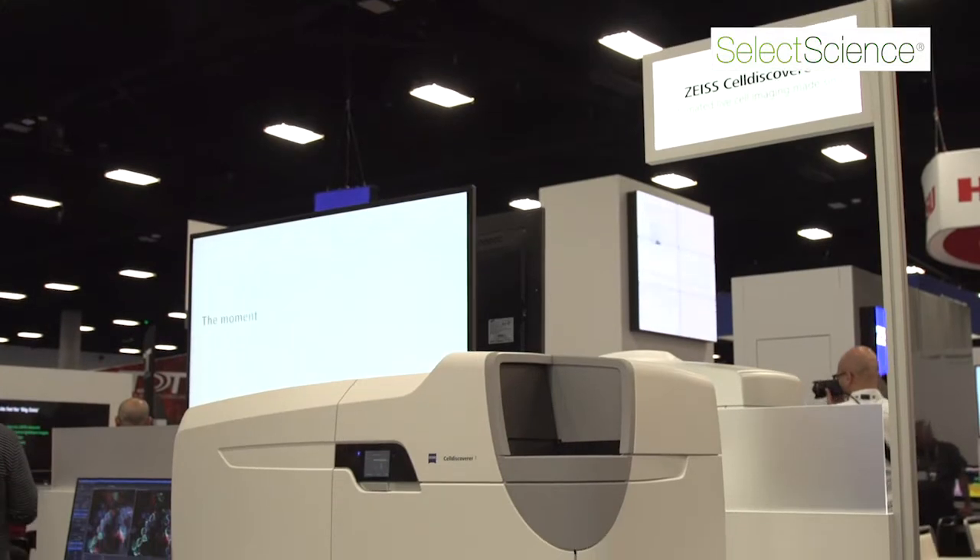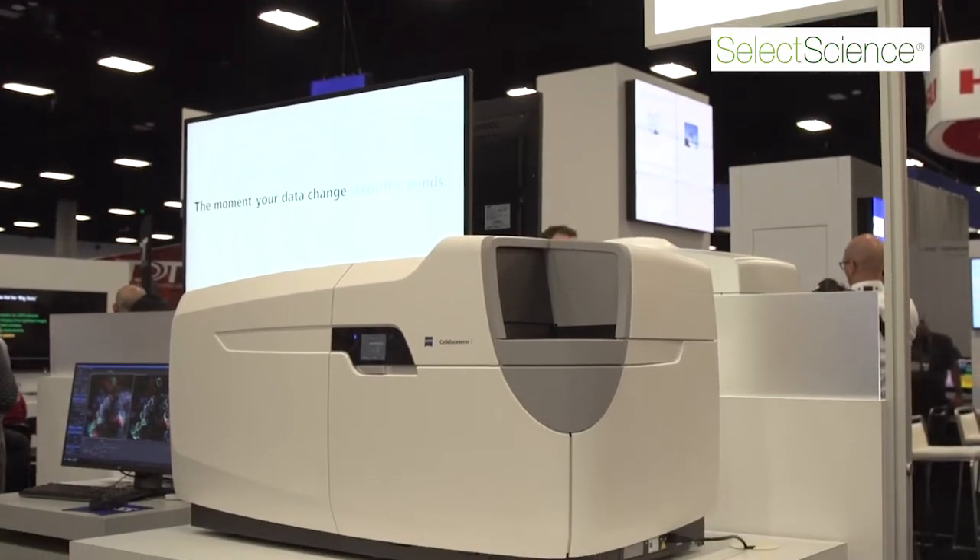The Cell Discoverer 7 is a new automated platform from Carl Zeiss designed to do live cell imaging on plates, wells, well dishes, or slides.